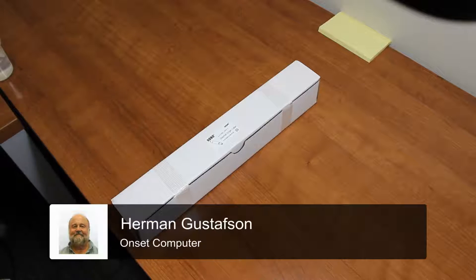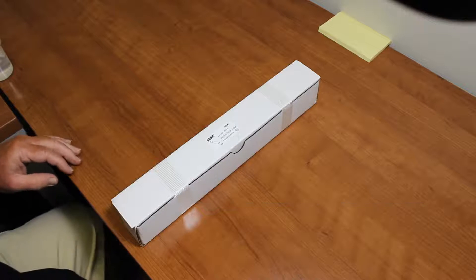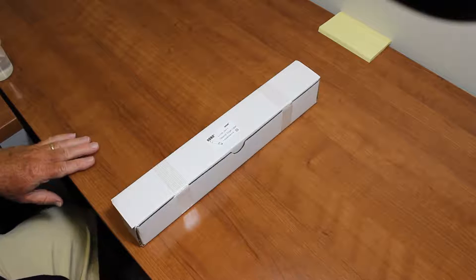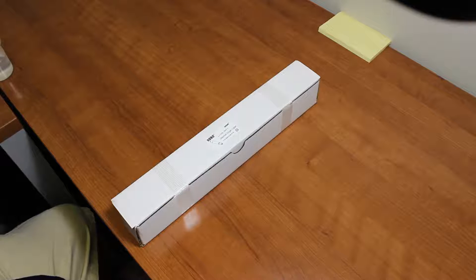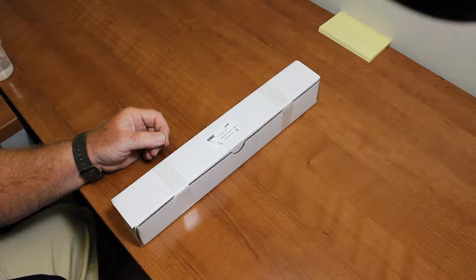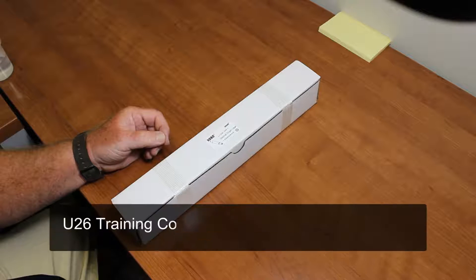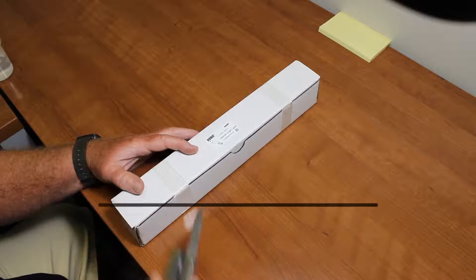We're going to unpack our U26 DO logger here and prepare it for deployment tomorrow. We want to open the package, install the sensor cap, and do a lab calibration. We're going to document that for you. These steps were also covered in the U26 training course in more detail, but we're going to open up the package.